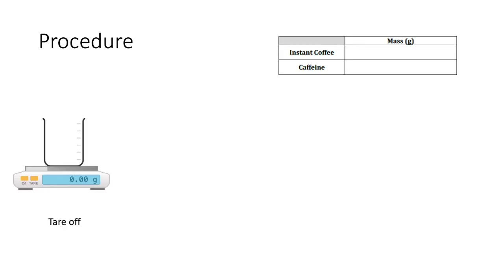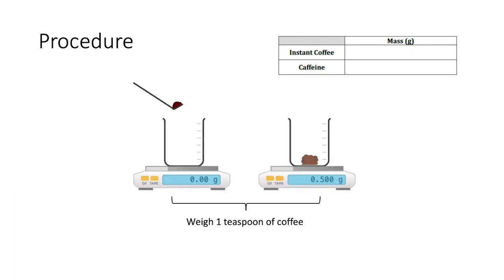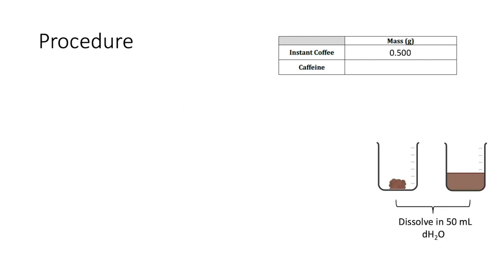To start the experiment, we need to make some instant coffee. You should tare the mass of a beaker and then weigh 1 teaspoon of instant coffee into the beaker and record the mass. Once you've done this, dissolve the instant coffee in approximately 50 milliliters of distilled water. You can just measure this using the graduations on the beaker, because the volume used isn't that important.